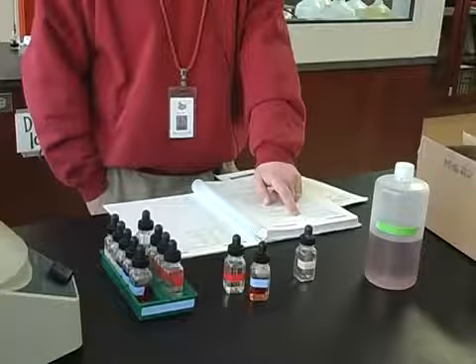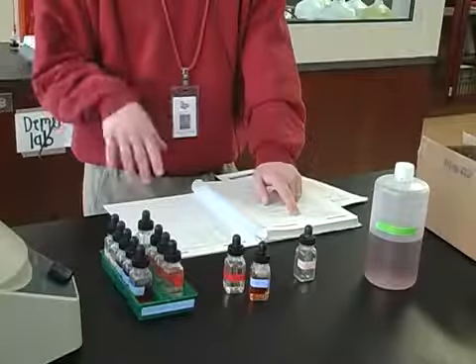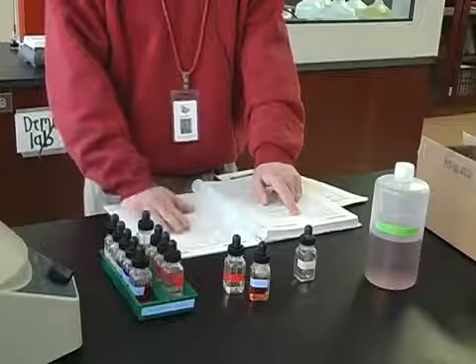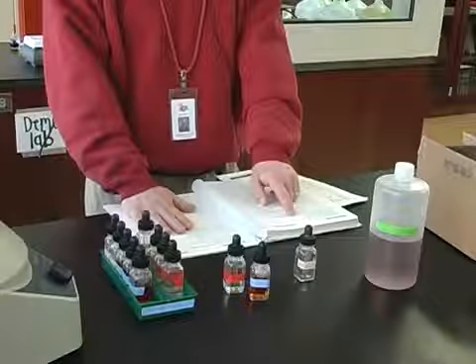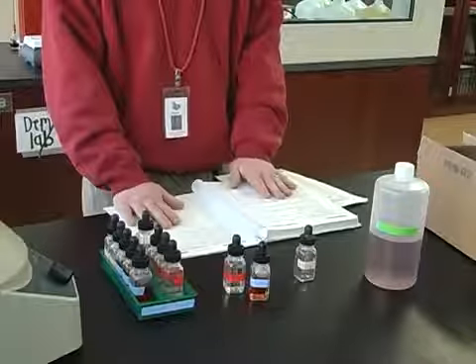What about silver and mercury? Would those be present? Since it all dissolved in hot water, they couldn't be there, right? Because they would have stayed as a precipitate. So the ions that are absent are silver and mercury. Ions undetermined, you can say none of them are.